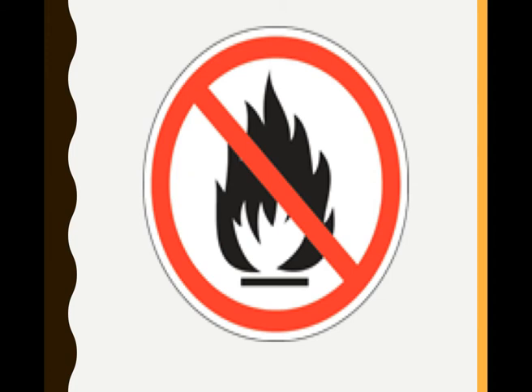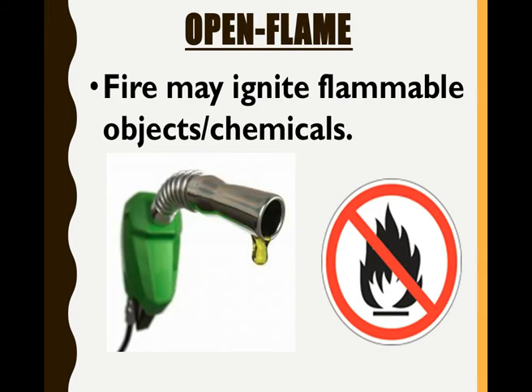Take a guess as to what this symbol means. This means there should be no open flame. This is a flammable object. You cannot have it near an open flame or it will combust.